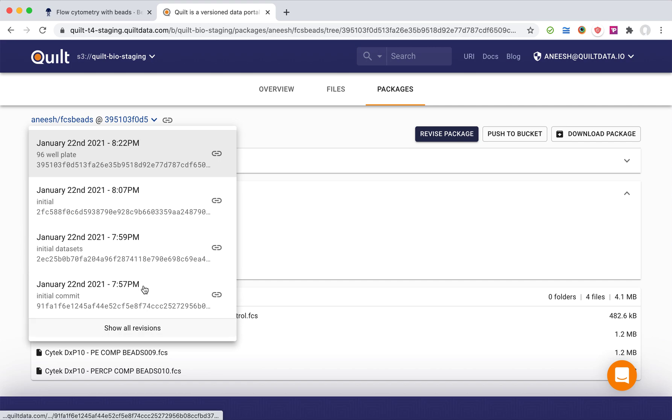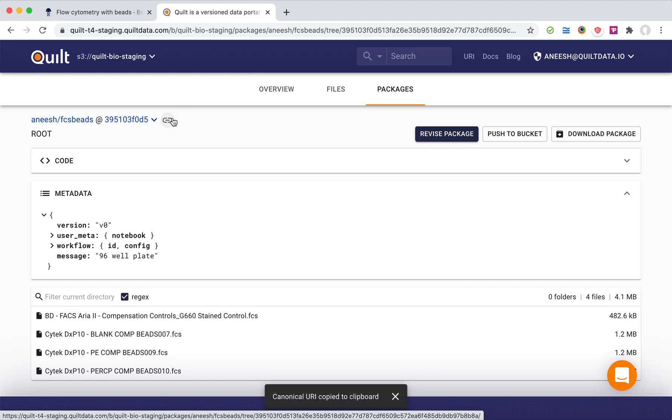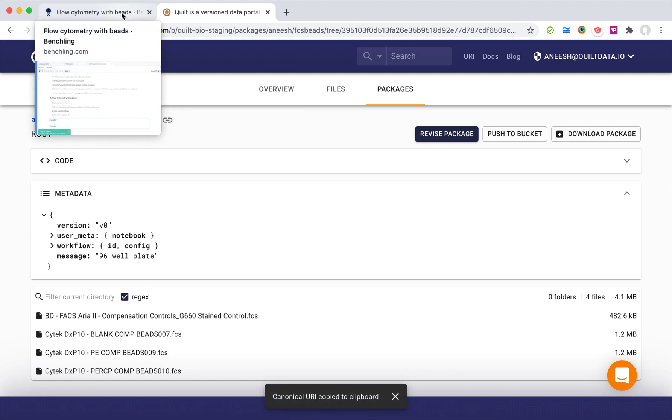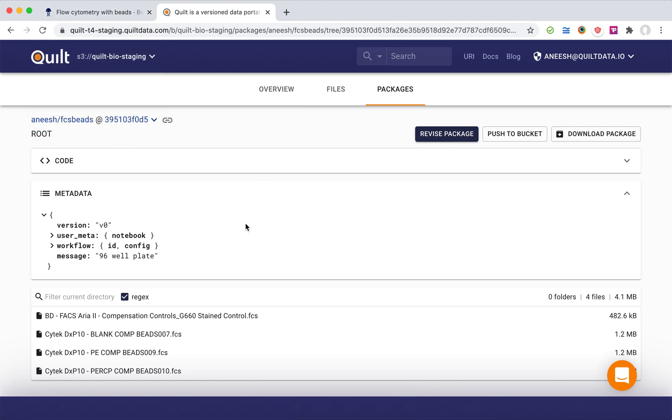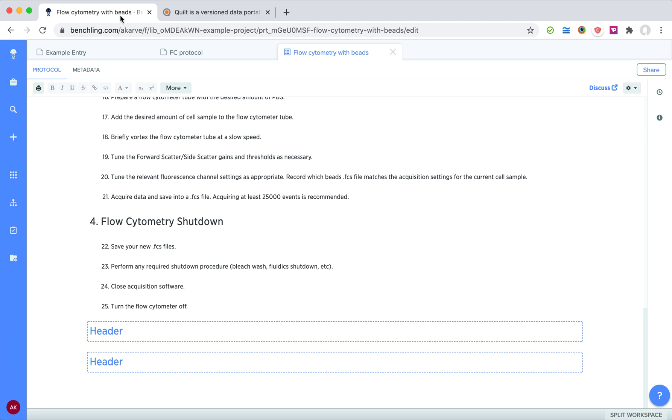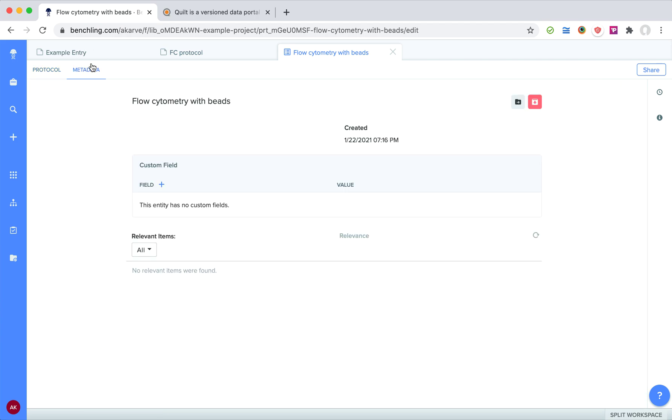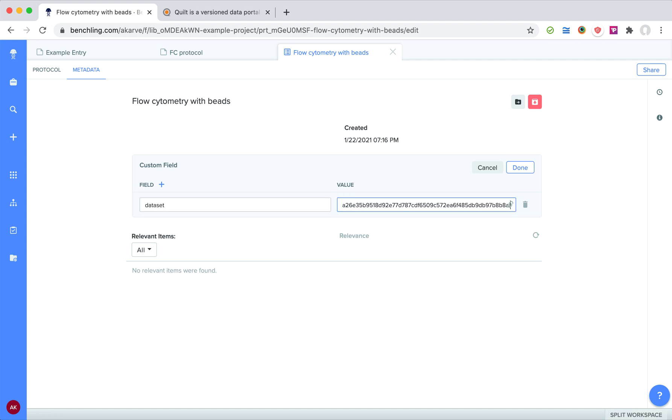Importantly, now I can actually copy this link here and now I have a bi-directional link. So my dataset, you'll notice here, knows which notebook in Benchling it came from. And now in Benchling I can actually go to the metadata section and I'm going to create a new field here. I'm just going to call it dataset and I'm going to drop that link that I just copied from Quilt in here. Now the dataset knows about the notebook and the notebook knows about the dataset, and I have a really powerful system.